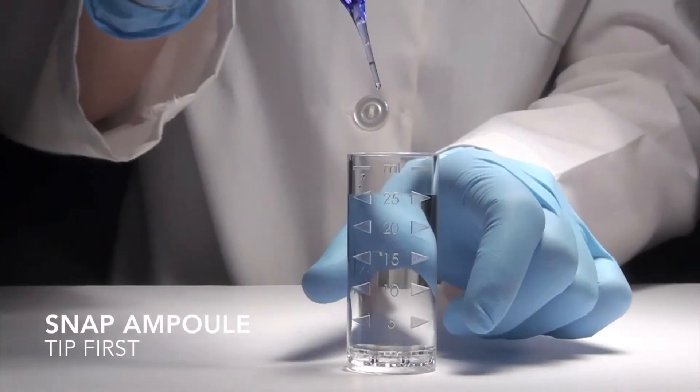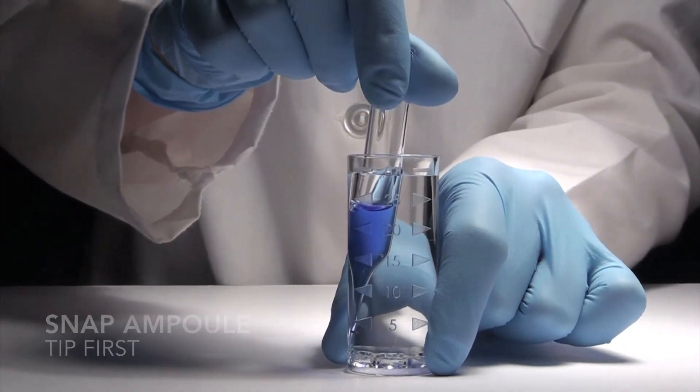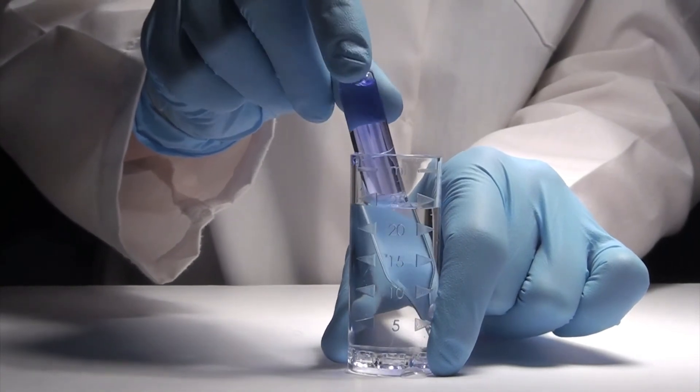Immediately place the Vacuvial ampoule from which the reagent blank value was generated, tip first, into the sample cup. Snap the tip. The ampoule will fill, leaving a bubble for mixing.